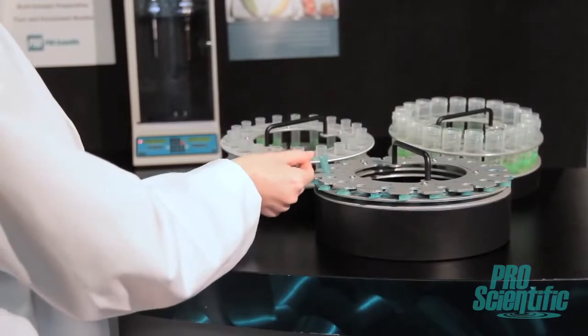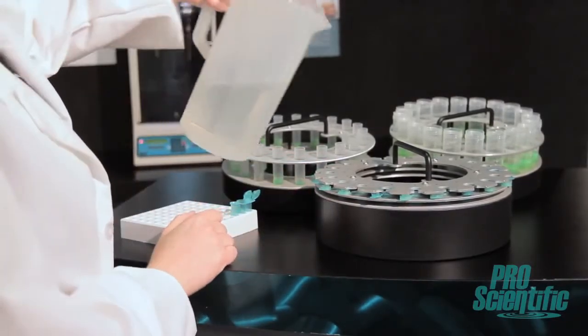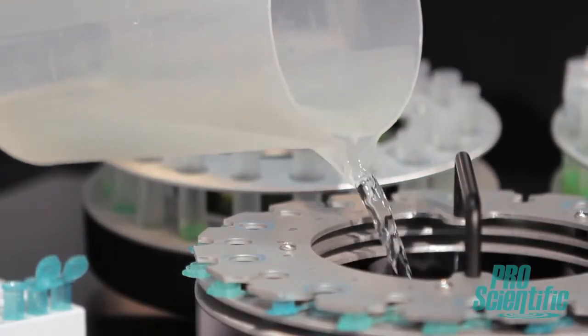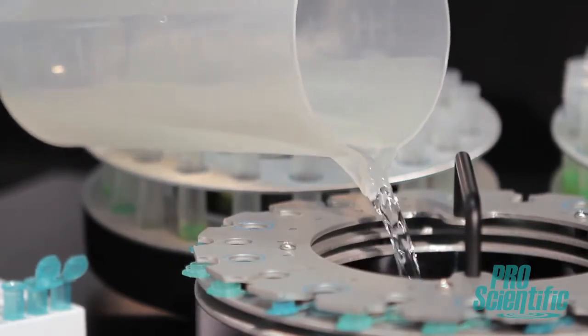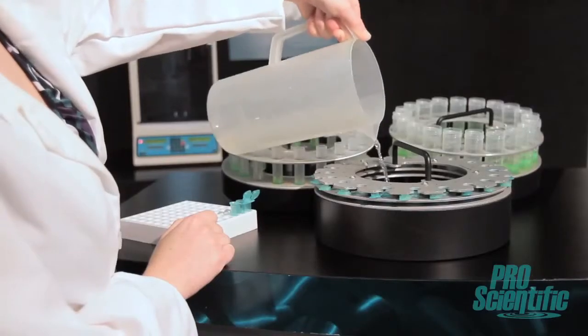Sample integrity is also maintained with our unique cooling carousel tray design. Carousel trays can be easily filled with cooling beads or an ice bath for when samples need to remain at sub-ambient temperatures. This is ideal when using the DPS20 as an automated sonicator.